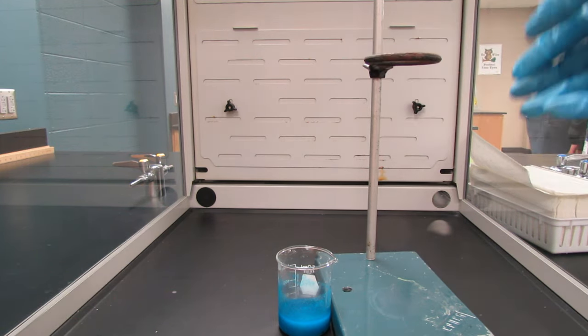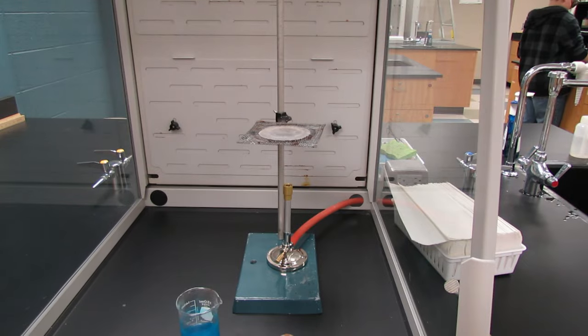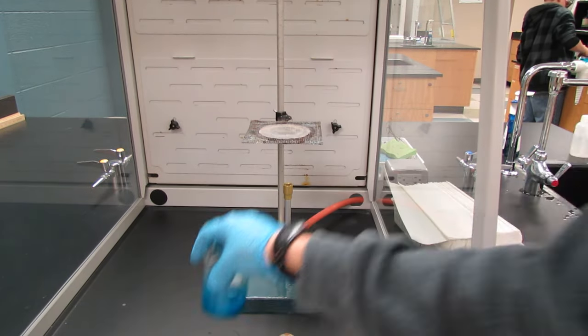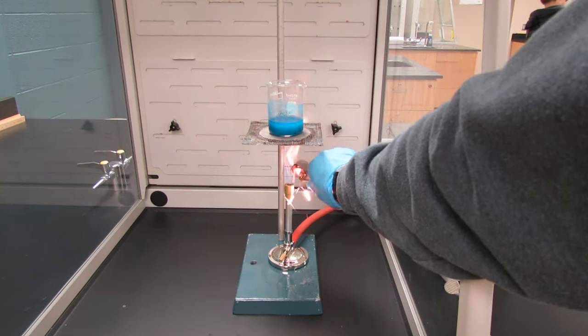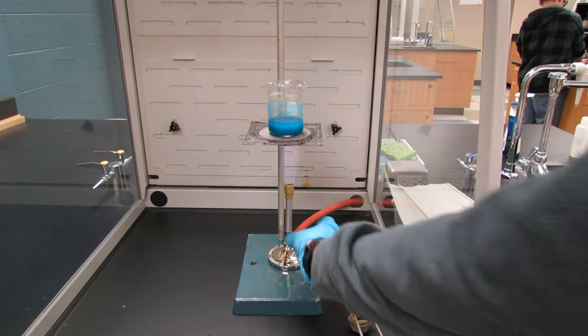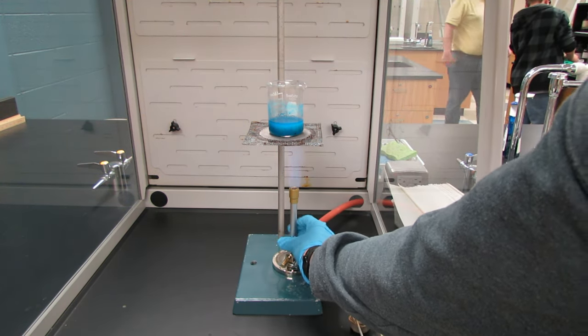Now set up a ring stand with a metal ring and a wire gauze so that we can set the beaker with the copper hydroxide right on top. Light your Bunsen burner and begin heating the copper hydroxide.